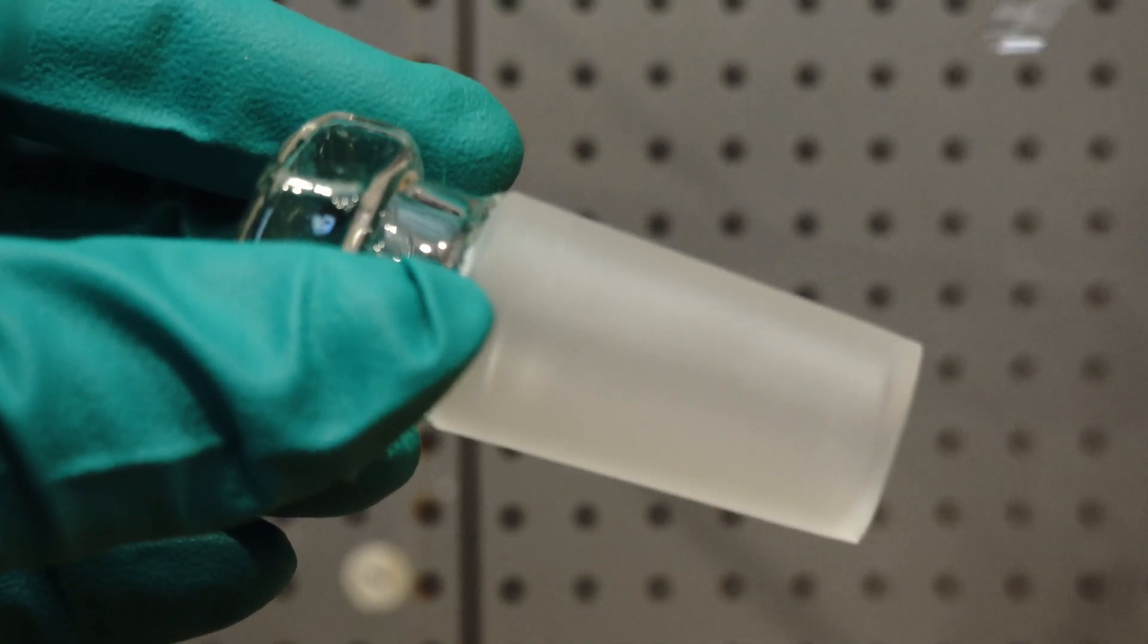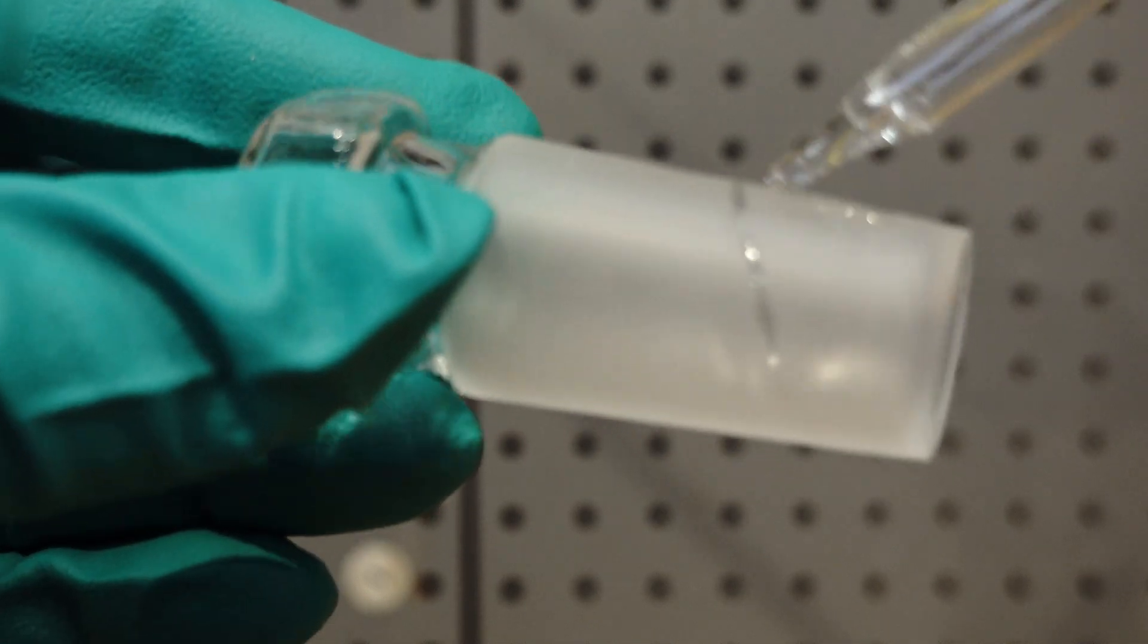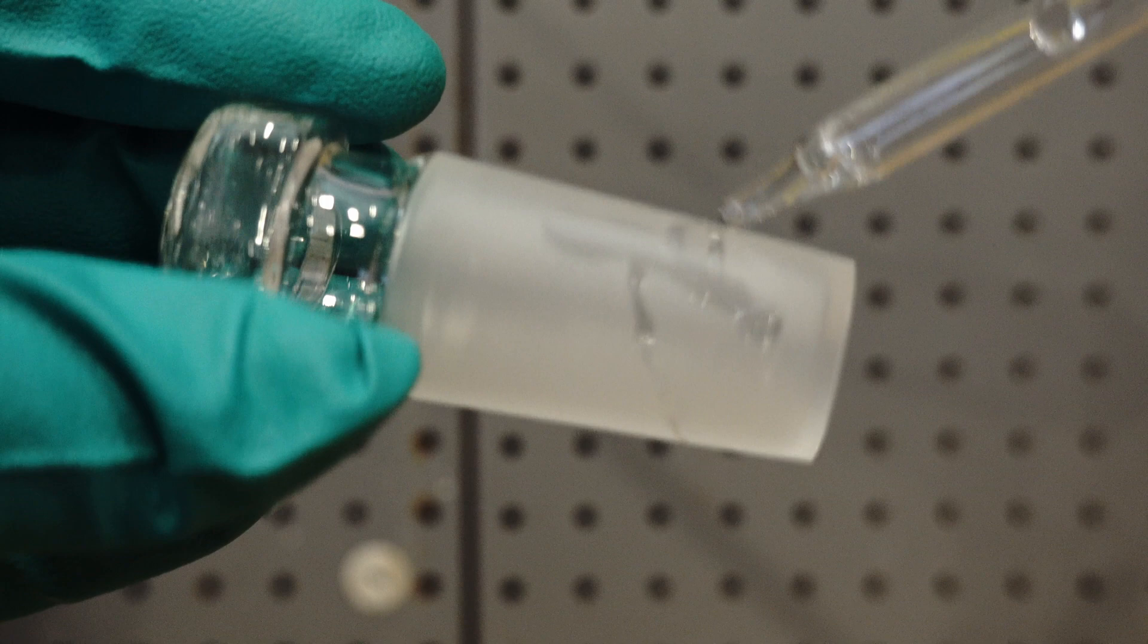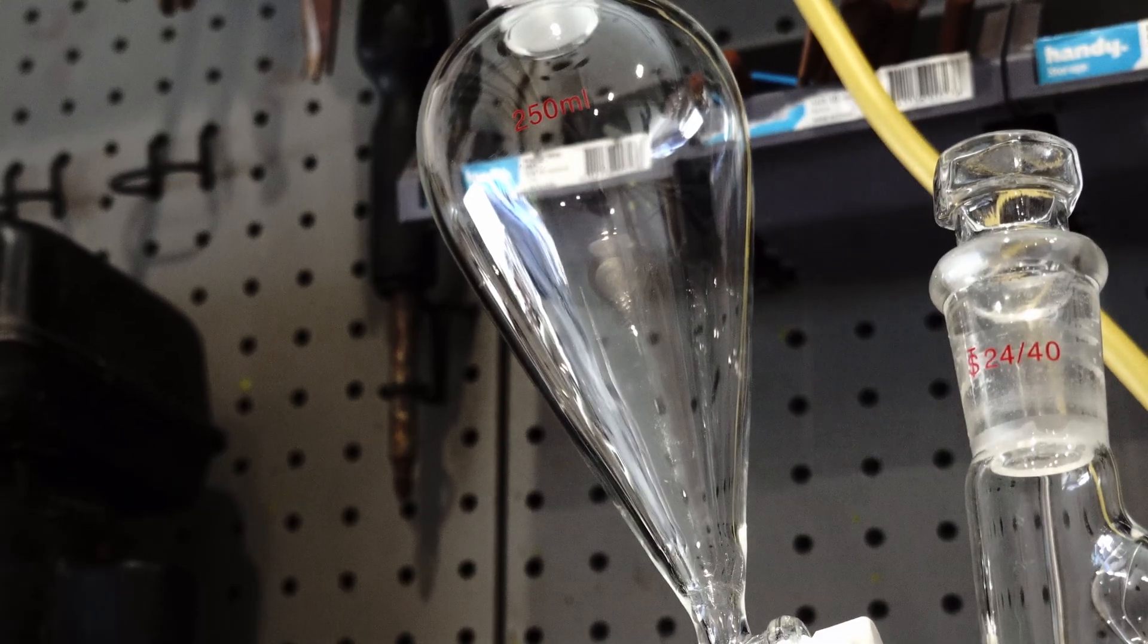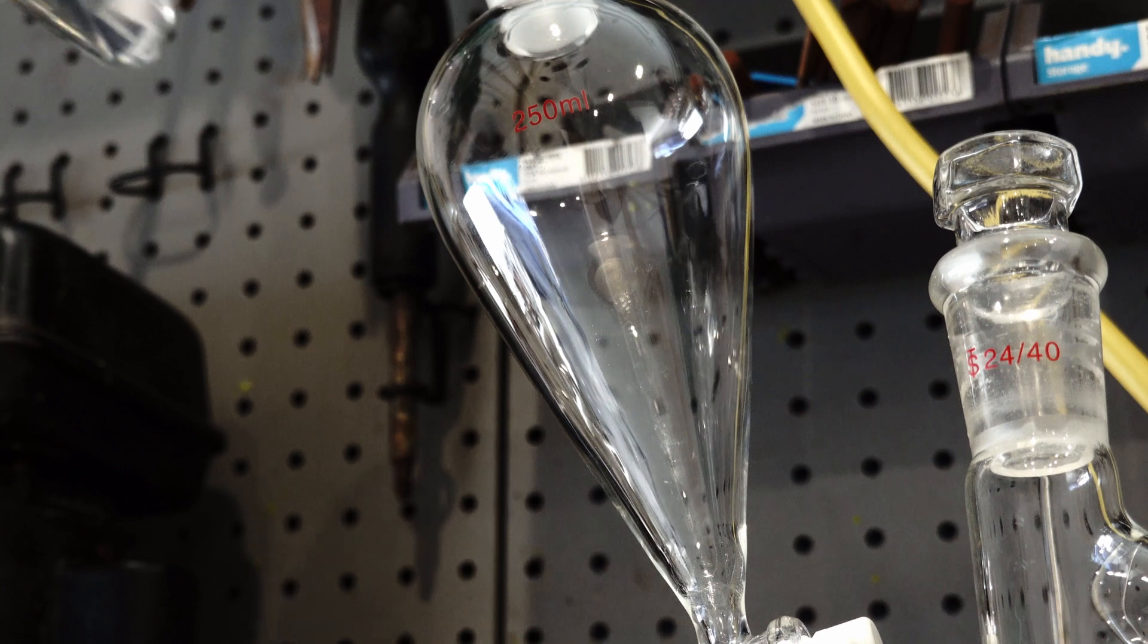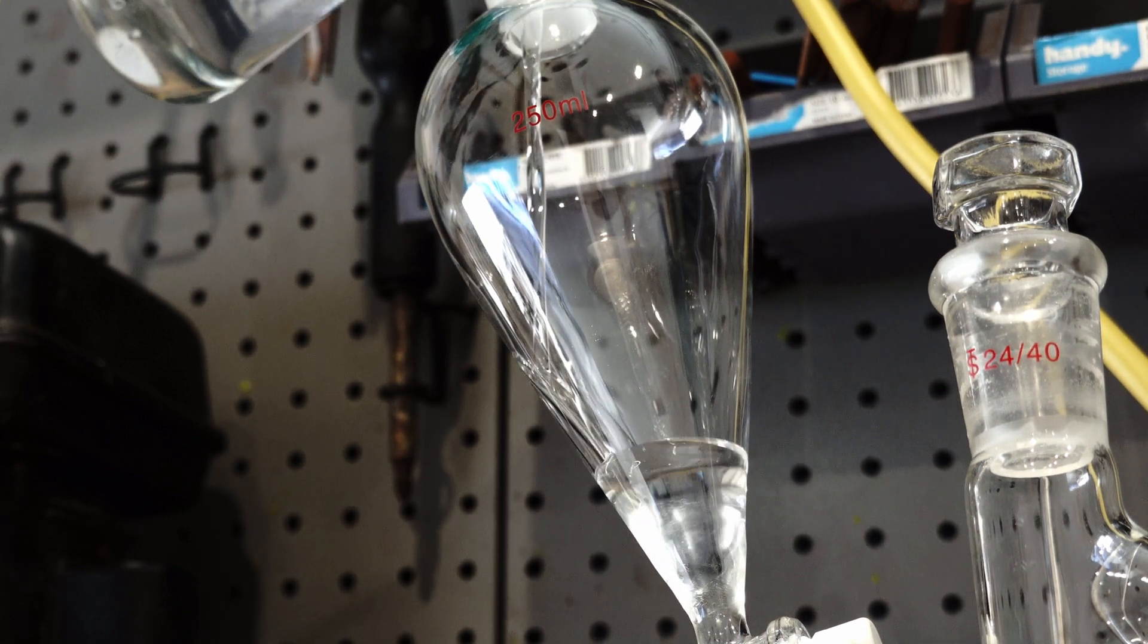An important step when doing this reaction is to lubricate all joints with sulphuric acid as normal grease would react with the produced Bromine. I charge a 250ml separatory funnel with 67ml of concentrated sulphuric acid.